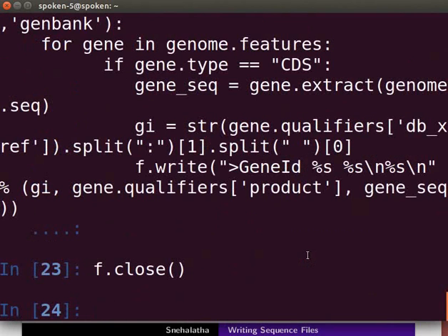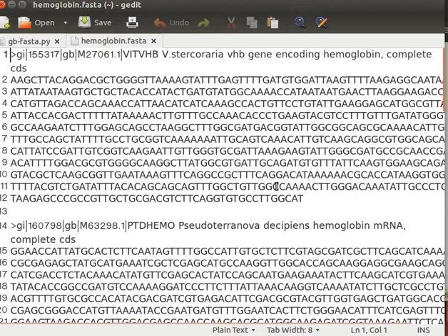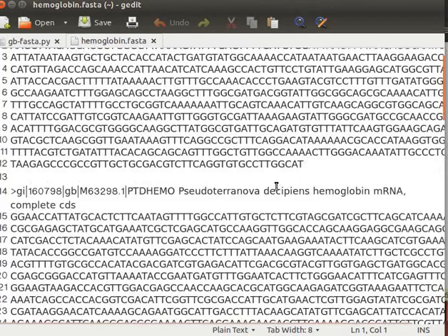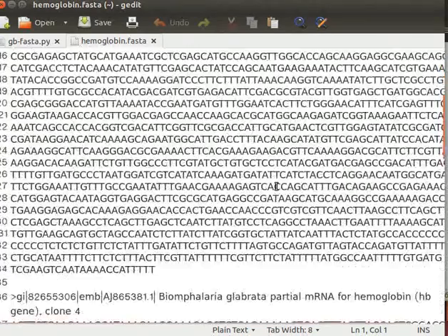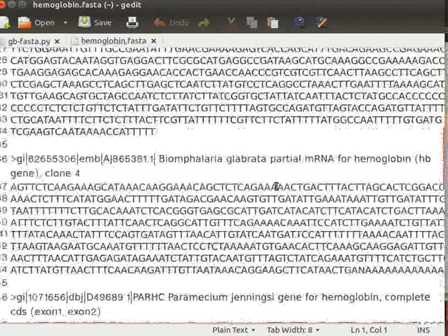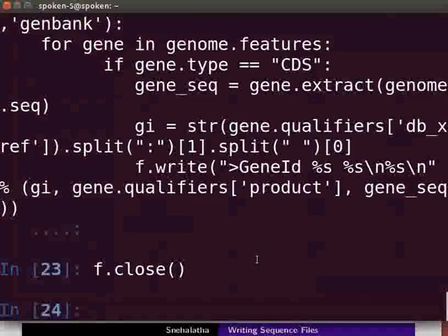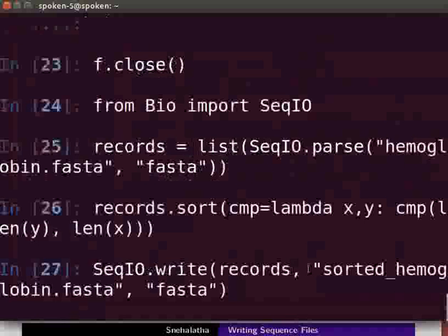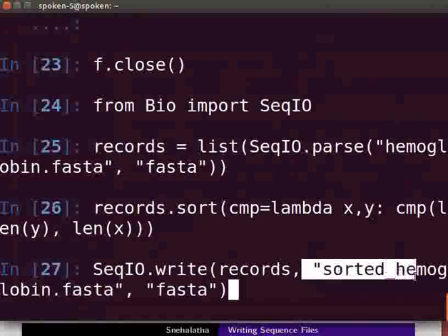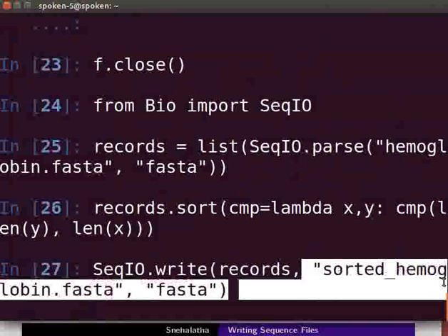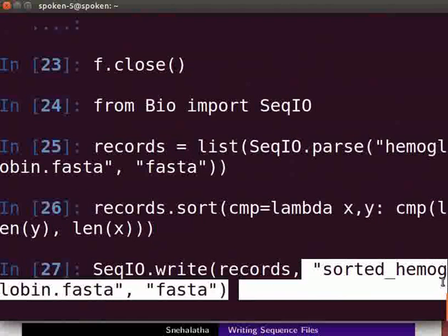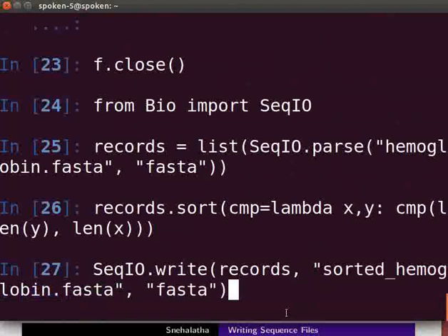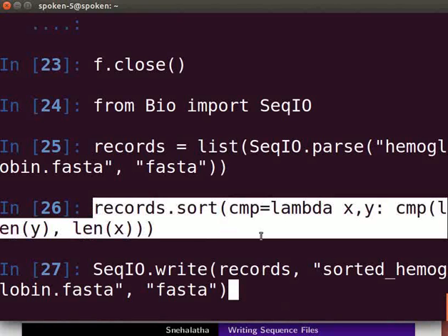Using BioPython tools, we can sort the records in a file by length. Here, I have opened a FASTA file, hemoglobin.fasta, which has six records, each of a different length. Type the following lines to arrange the longest record first. The new file with sorted sequences will be saved as sorted_hemoglobin.fasta in your home folder. For short records first, reverse the arguments in the records.sort command line.